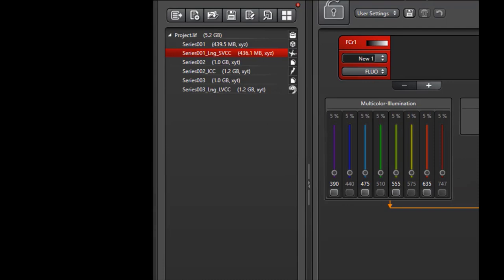The default Leica file format is called a .LIF file, which stands for Leica Image File. We often call it a LIF for short. These LIF files have the default name of Project. Within a project, you can have one or multiple images. In this example, there are six.